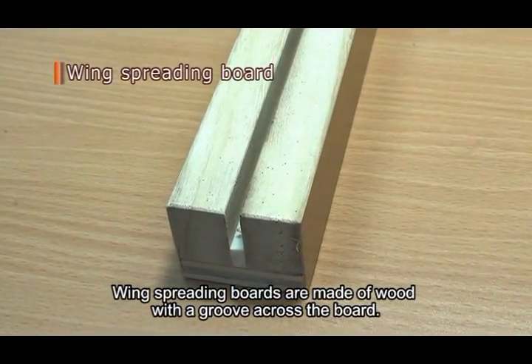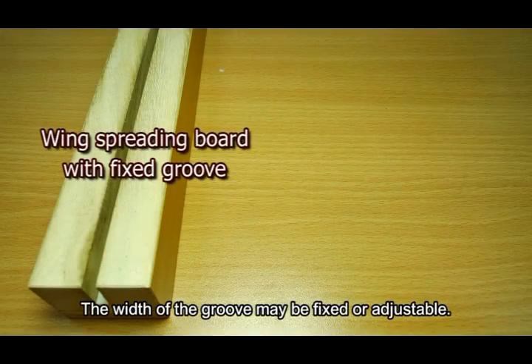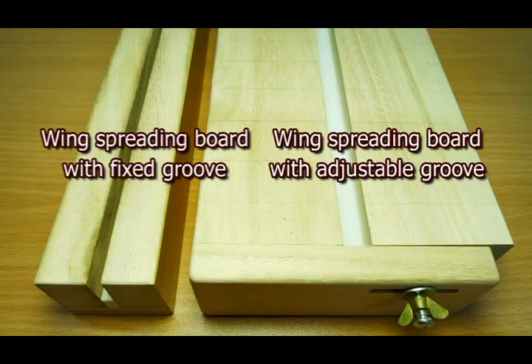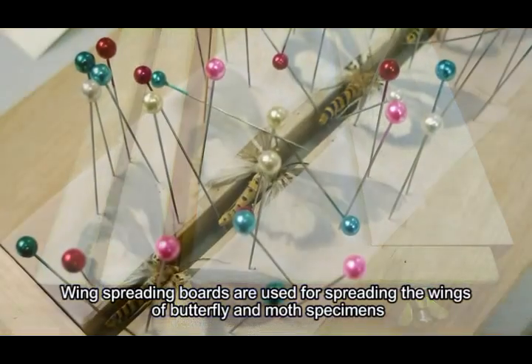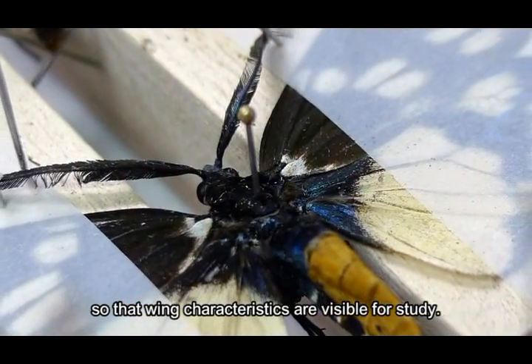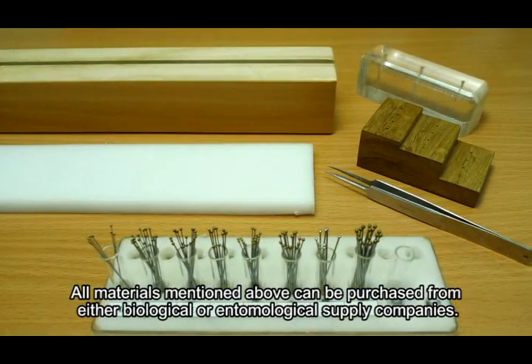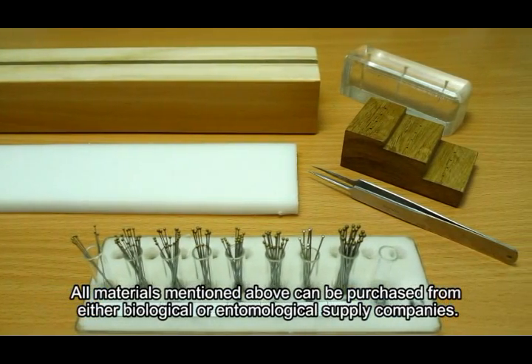Wing spreading boards are made of wood with a groove across the board. The width of the groove may be fixed or adjustable. Wing spreading boards are used for spreading the wings of butterfly and moth specimens so that wing characteristics are visible for study. All materials mentioned above can be purchased from either biological or entomological supply companies.